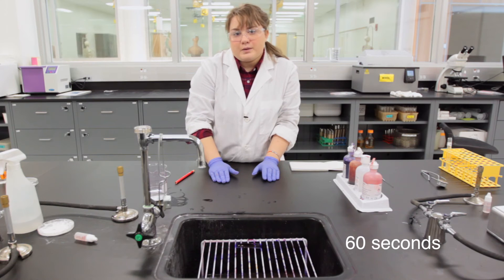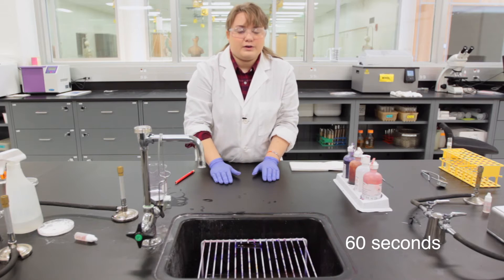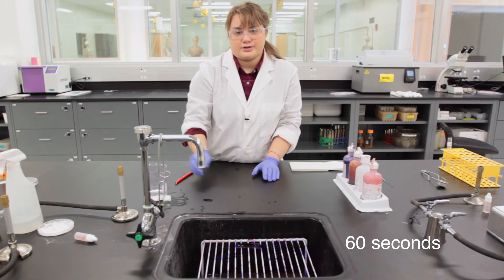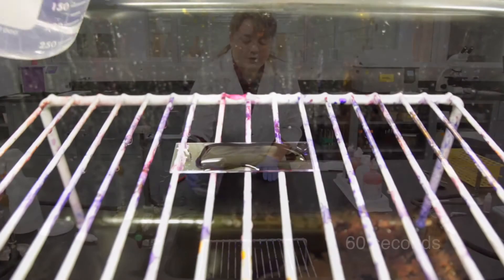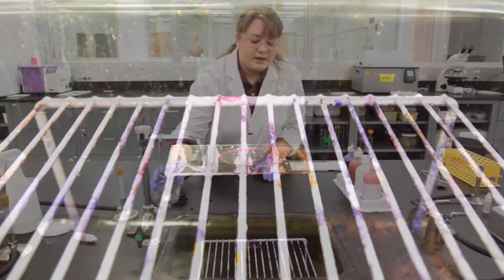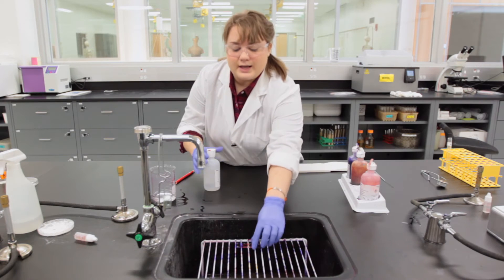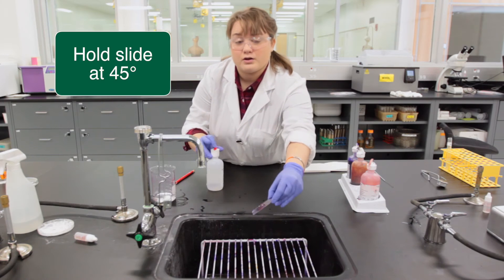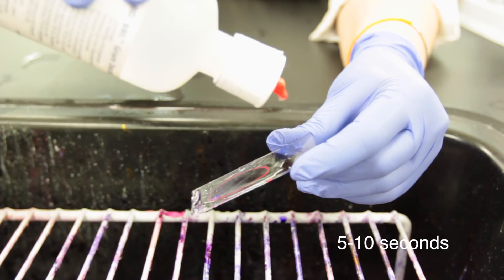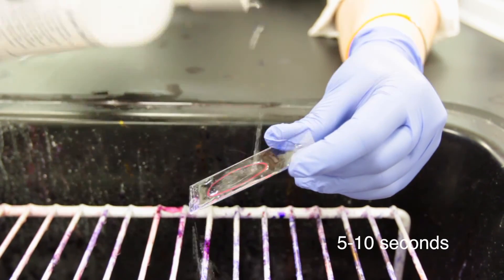In the gram-negative bacteria, this complex forms on the outer membrane and will be washed off with the ethyl alcohol, which is our next step. Following the one-minute iodine step, rinse it off, hold the slide at a 45-degree angle, and apply the ethyl alcohol for five to ten seconds.